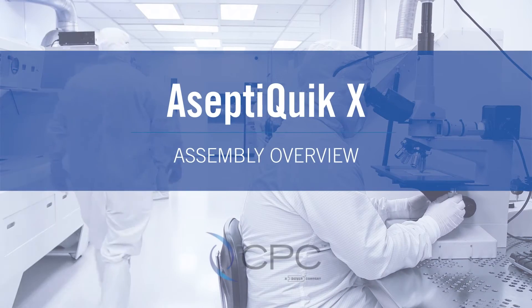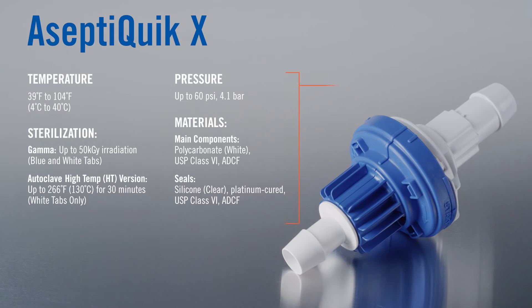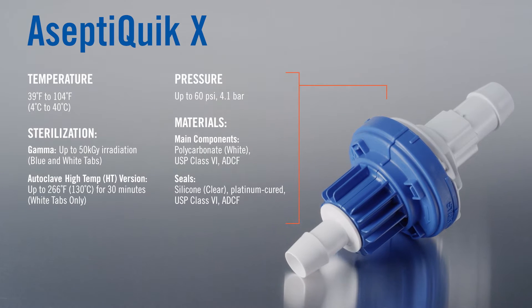Welcome to CPC's AseptiQuik X assembly video. Before we start, please reference these product specifications for best operating results.